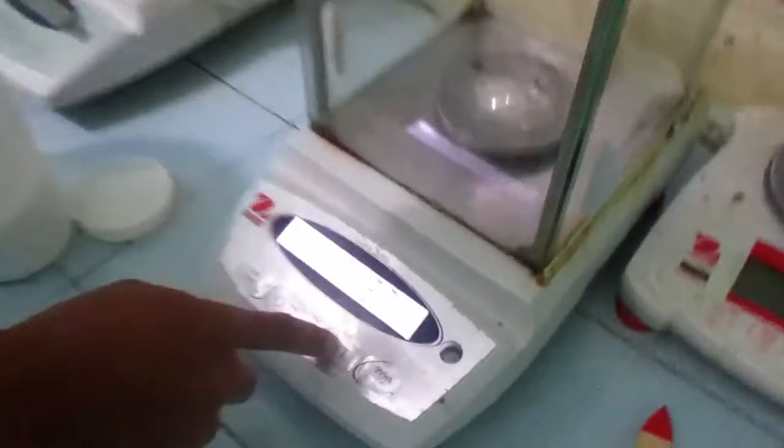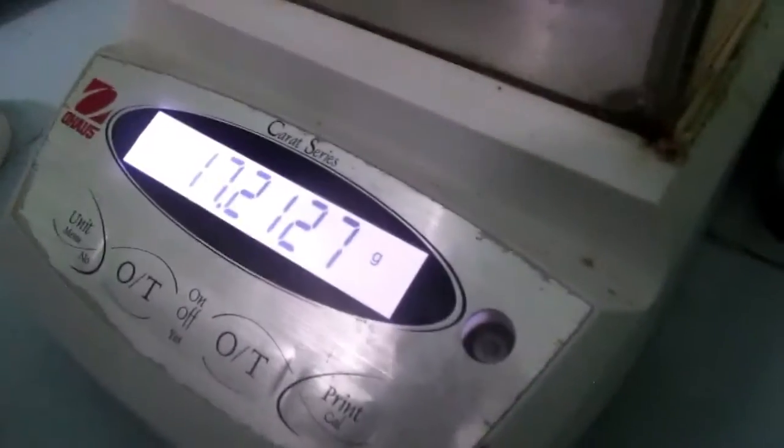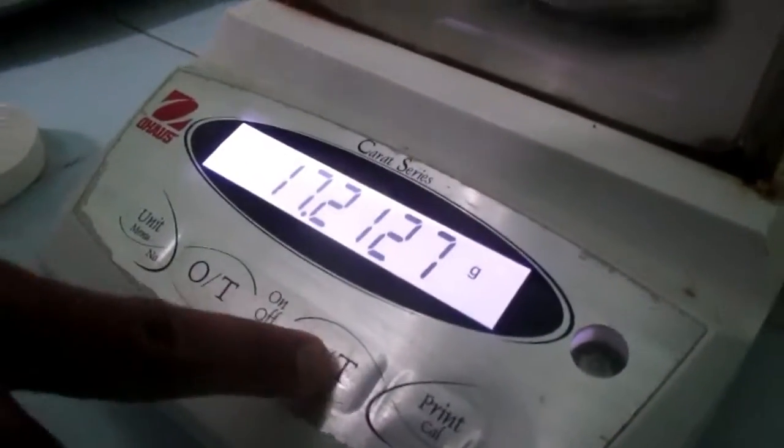Before we weigh the chemical solid, we need to tare the scale back to zero decimal by pressing the tare button.